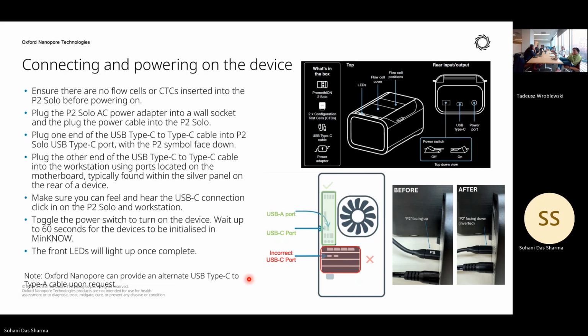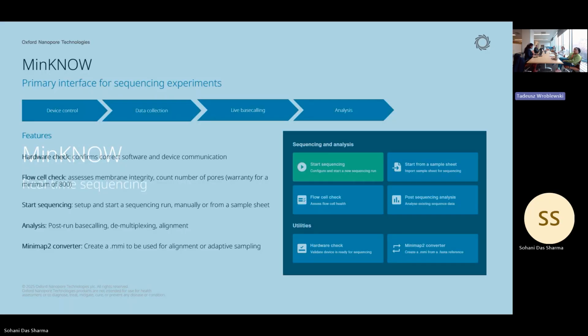I hope that's not going to happen to you, but if it happens, don't rely too much on this. Just see what the software is telling. If there is an error, it will show. If it is not showing, then it's fine. Yeah, I think so for today.